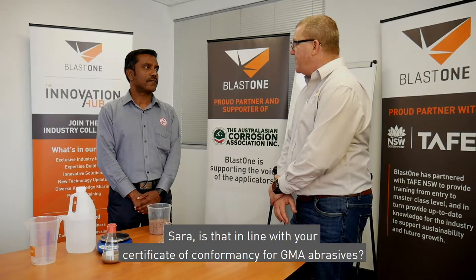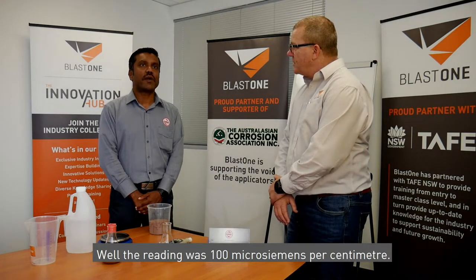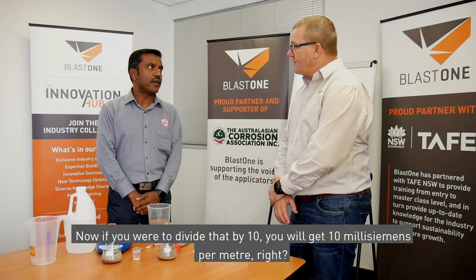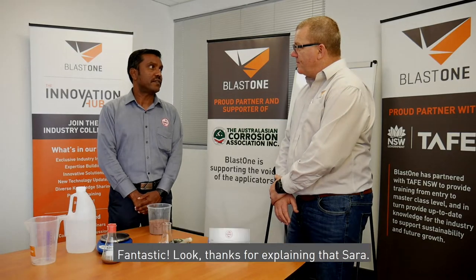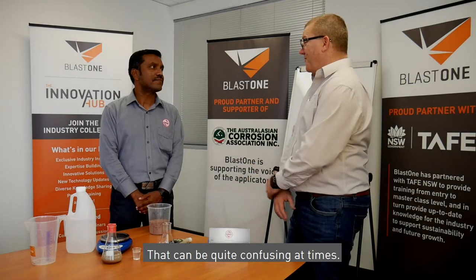Sara, is that in line with your certificate of conformance for GMA abrasives? The reading was 100 microsiemens per centimetre. If you were to divide that by 10 you will get 10 millisiemens per metre. That is in line with our certificate of conformance which has a limit of 25 millisiemens per metre. Fantastic — thanks for explaining that Sara, that can be quite confusing at times.